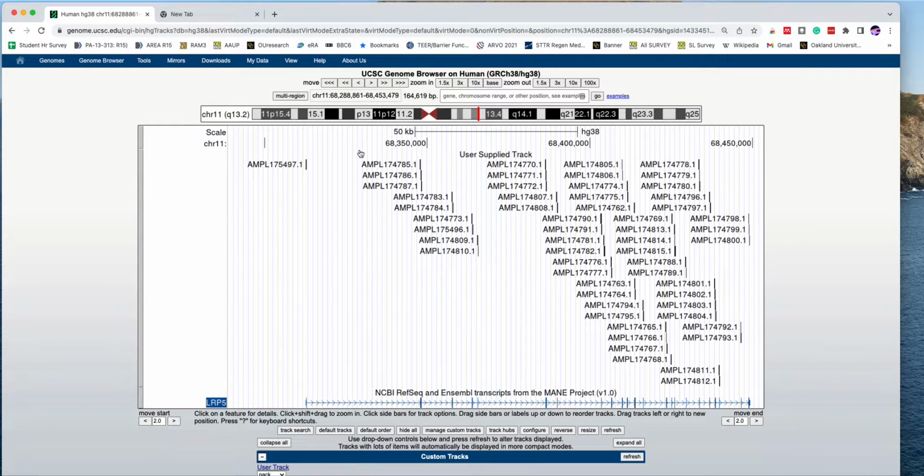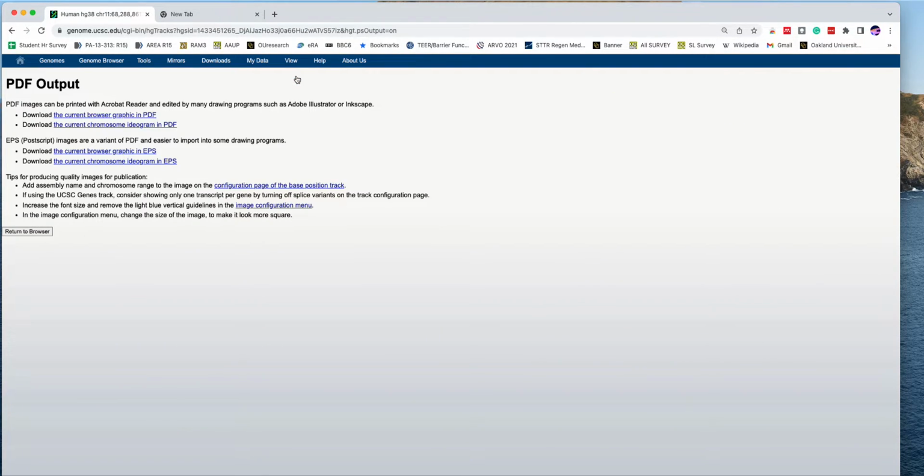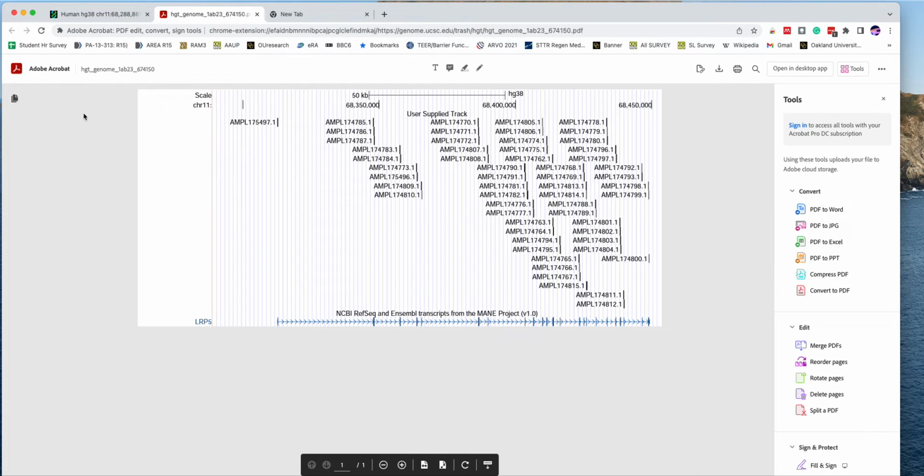And that's very easy, because once this is set up looking pretty, you just go to your view option up here. You see a PDF PostScript section. Go into here. We will use PDF images, and this one, you click it, it will download for you, or it will get for you first this image.